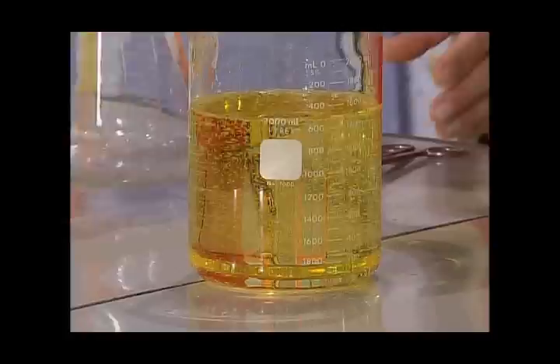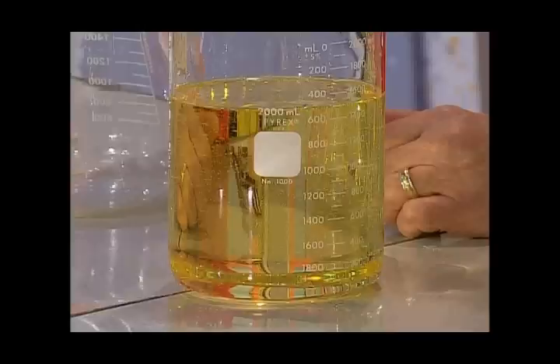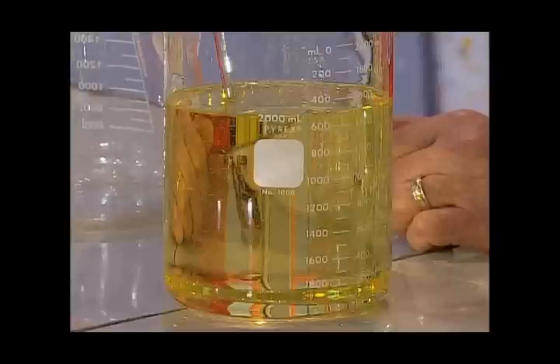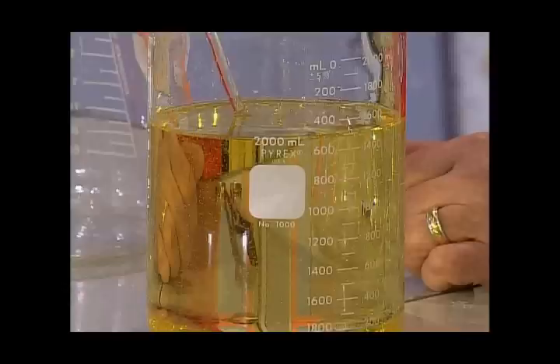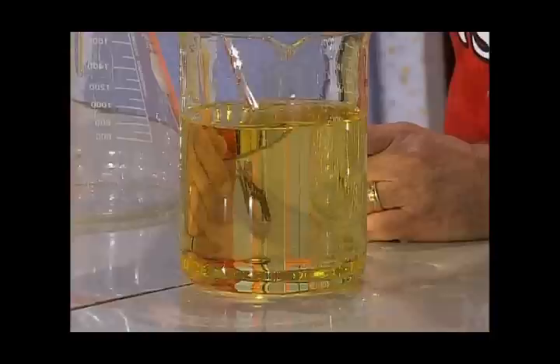You see that? Hey, what happened to the beaker? What happened to the small beaker? Is it still there? Yes. Can you see it? No. It's invisible, right? But it's there. I take this glass rod and I put it in there. See, it taps against it. Wait a minute. What happened to the rod? Did the rod disappear too? You can see the rod that's not in the yellow liquid is still visible, but the other one is invisible, right? So let me turn this around a little bit, see if this helps. So this is a good way to hide things, isn't it?